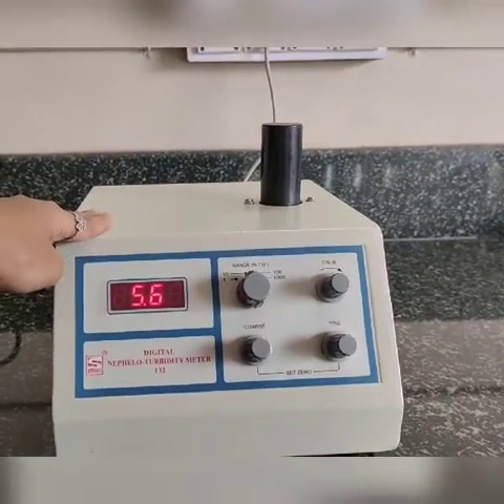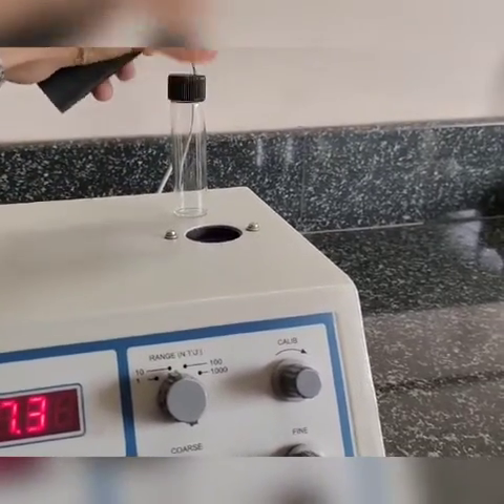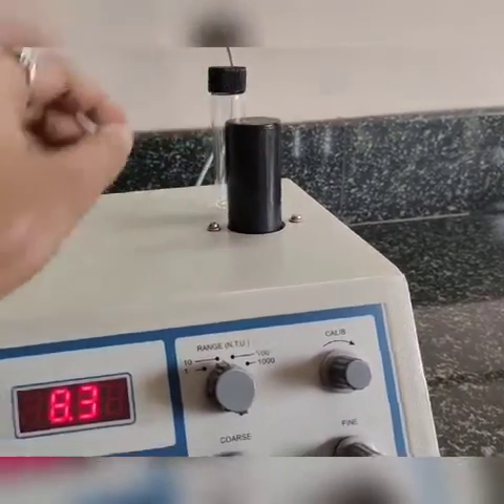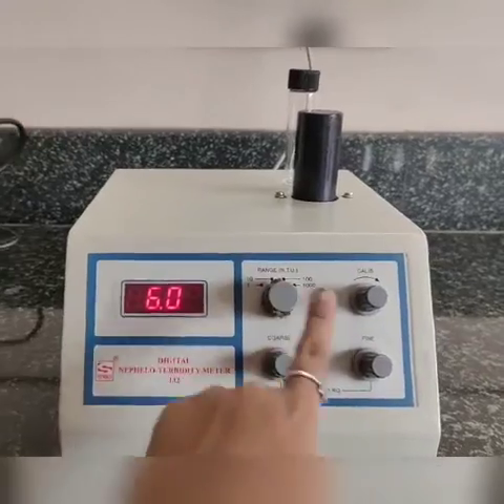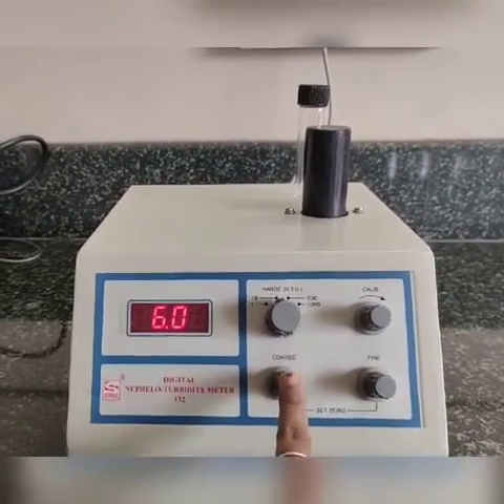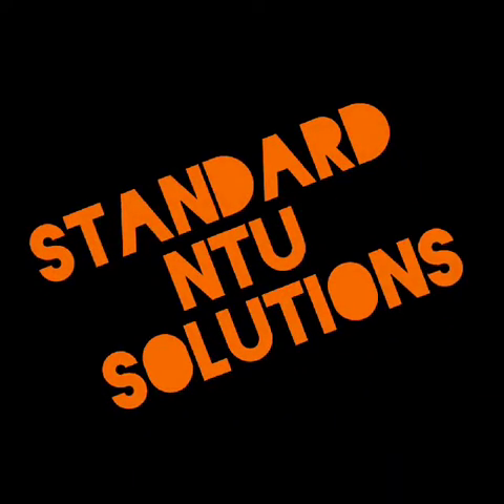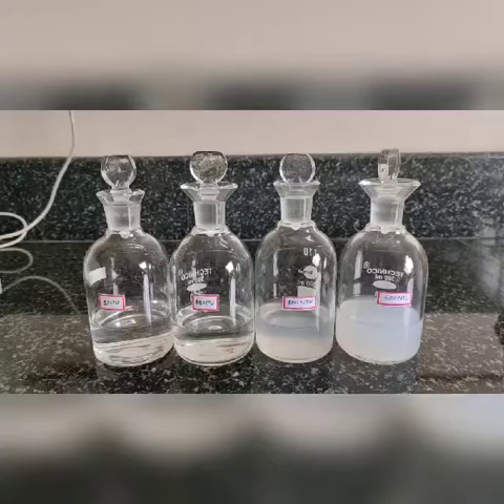This is a digital nephilometer. It consists of a test tube holder with lid, a range selection switch, a calibration knob, and coarse and fine adjusting knobs. To set the distilled water for zero, you need standard NTU solutions of 1 NTU, 10 NTU, 100 NTU, and 500 NTU.